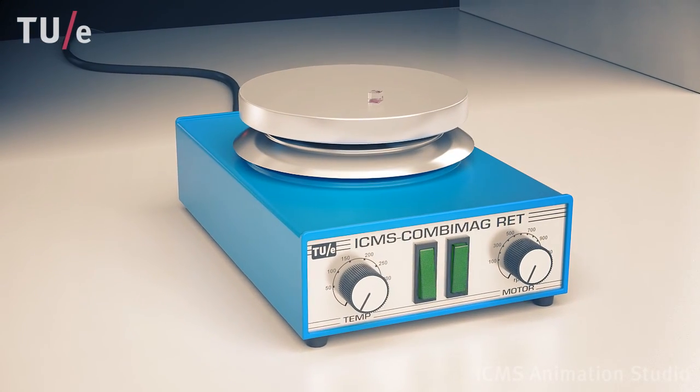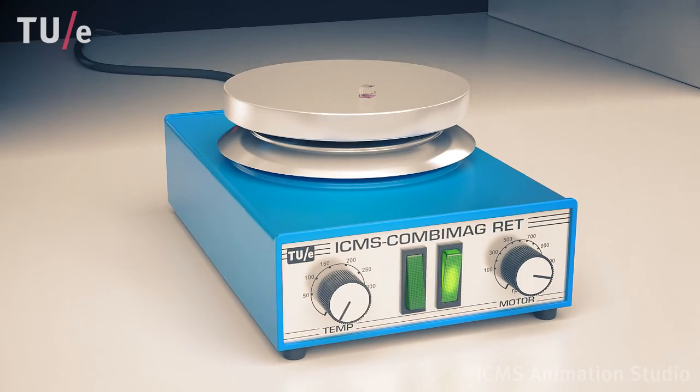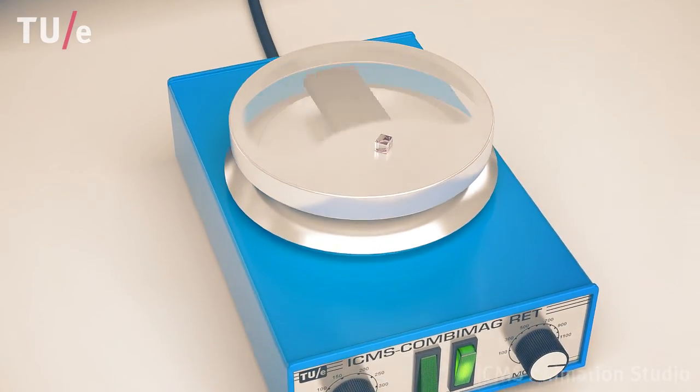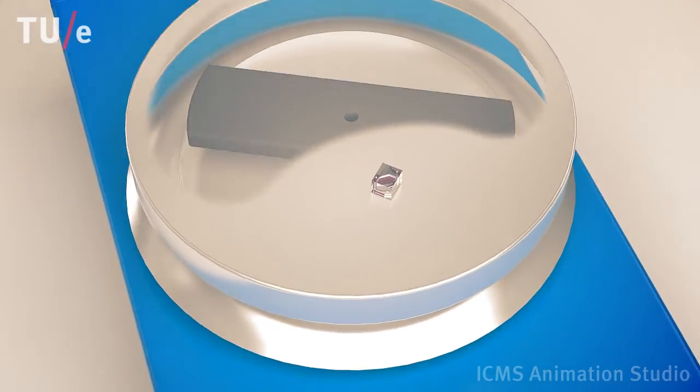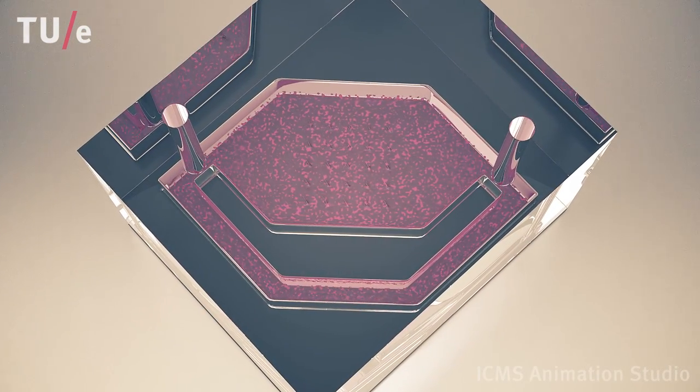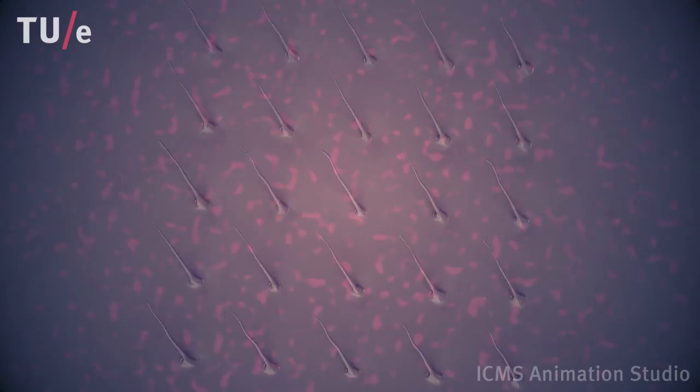The rotating magnetic field makes the artificial cilia rotate within the liquid, as shown by the motion of tracer particles present in the liquid. This generates substantial liquid velocities.